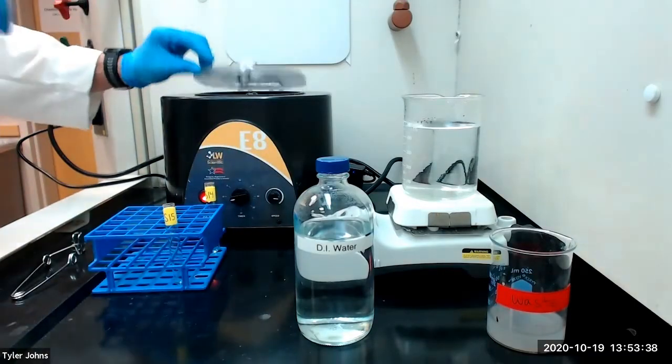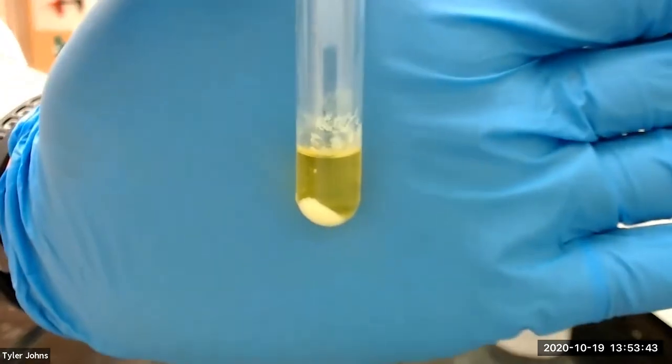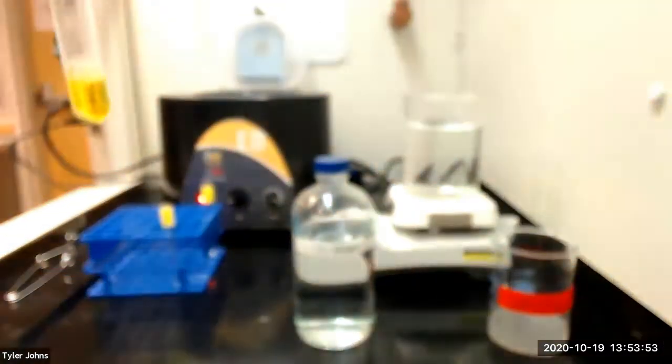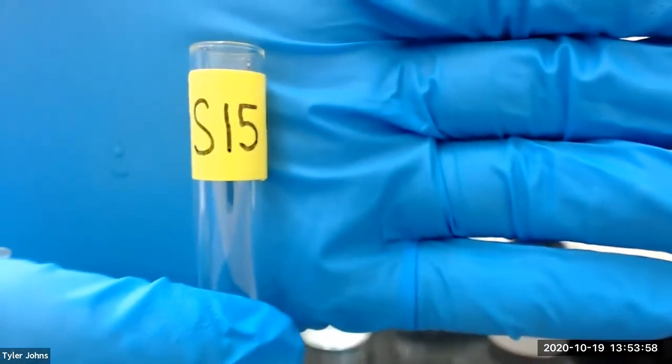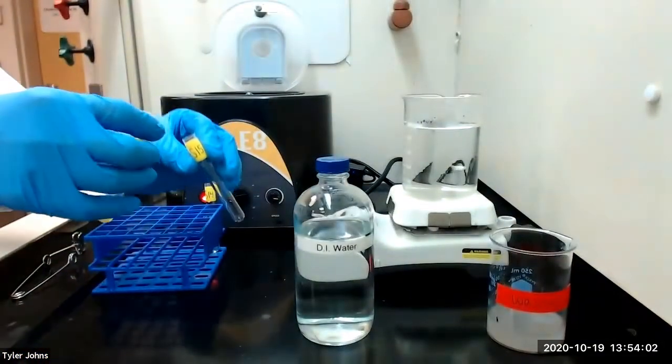This is what our mixture looks like after centrifugation. We will decant the solution into a new test tube labeled S15 and save the solution for the analysis of calcium ion.